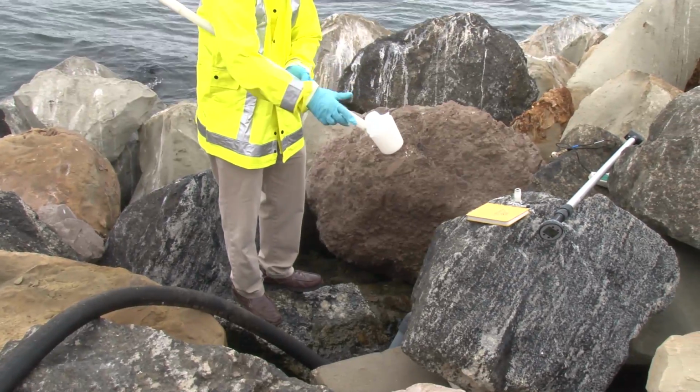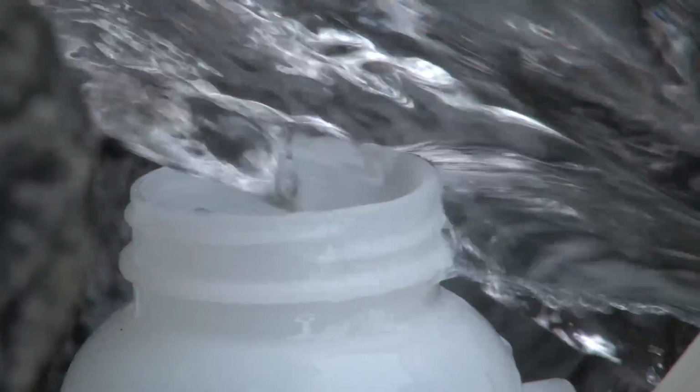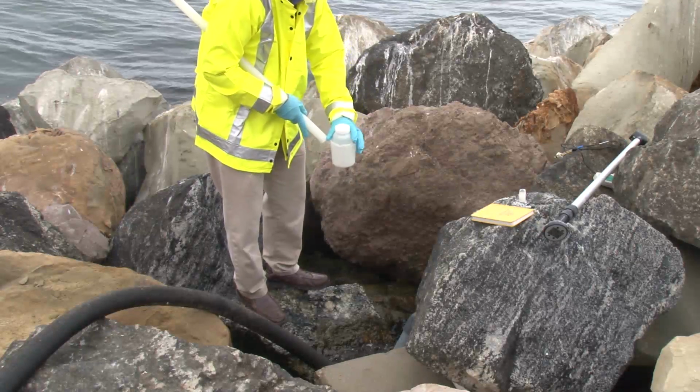Collecting for oil and grease requires a dedicated grab sample. Collect the oil and grease sample directly into the actual sample container to be sent to the laboratory. Doing so will ensure the integrity and representativeness of the sample.